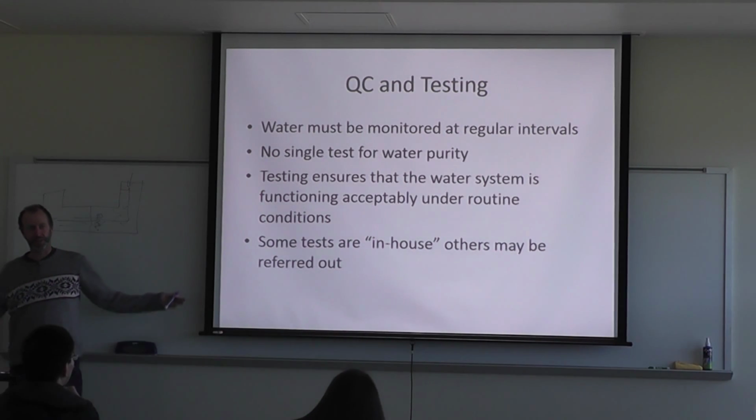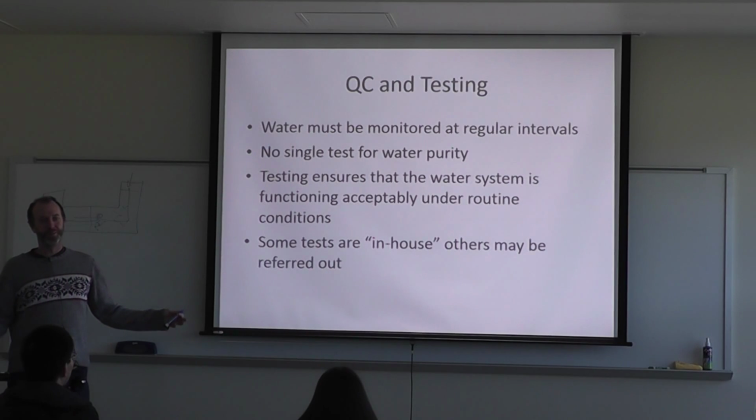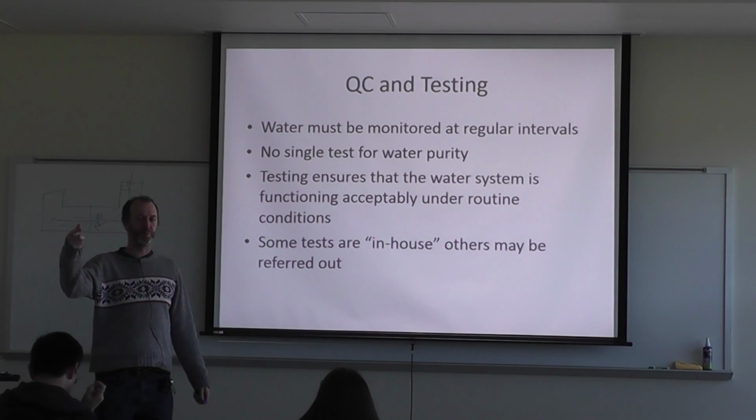So can anybody think of things you want to test for? No? Well, of course, you're going to test the resistivity. That'll probably be checked weekly or daily.